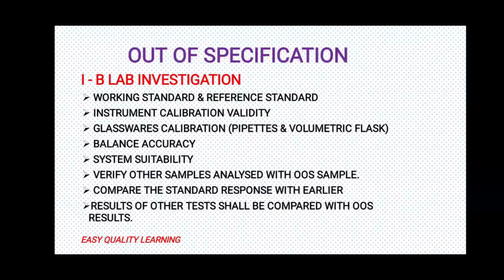Verify the samples analyzed with OOS samples. If we have taken this analysis in a particular sequence, or a number of samples are analyzed in this particular sequence, we need to verify the results and responses of other samples also with the OOS sample, so that we can get some vital information.